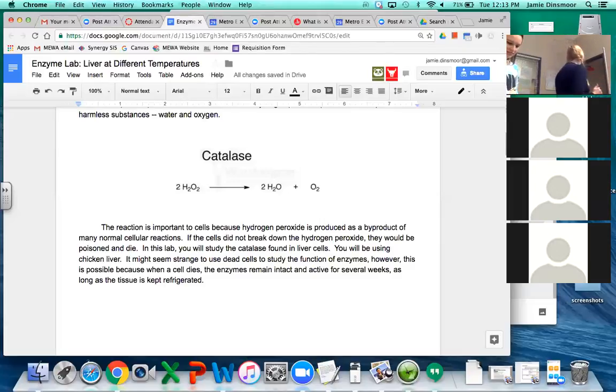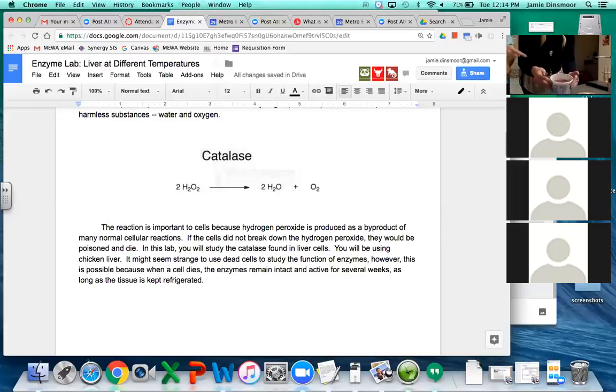You need something to cut this on, right? Oh, looks like guts or something. Just kidding, guys. Gross. Have you seen the little chicken hearts that they have? That stinks really bad. It's liver. What are we gonna cut it on? All right, we're just gonna cut it on the table. Let's move the computer out of the way. We have a plastic knife. Would you guys like to see us cut it? We'll angle it down a little bit. So chicken livers. Ew. I hope I don't pour blood on the computer. Actually, you can cut it on this thing maybe.